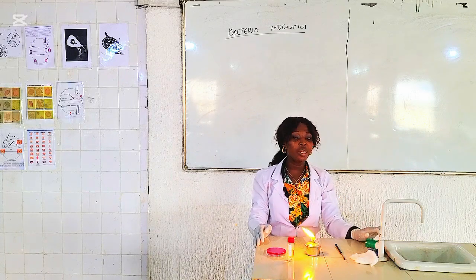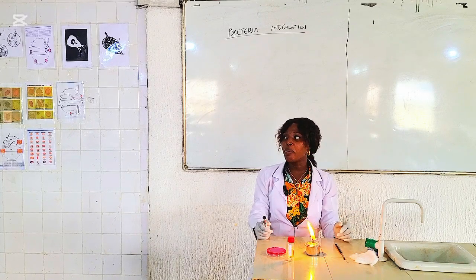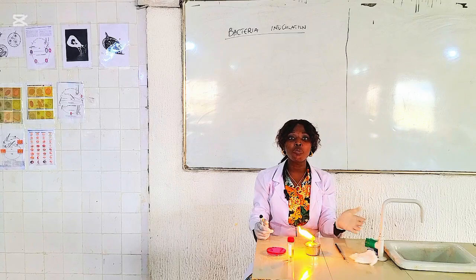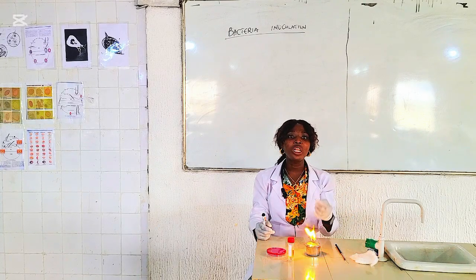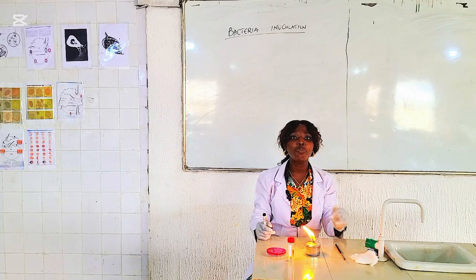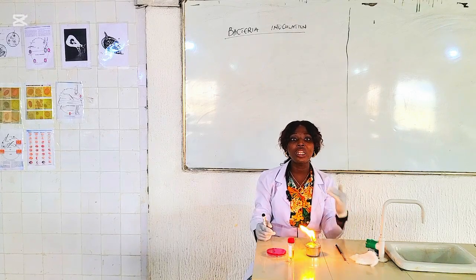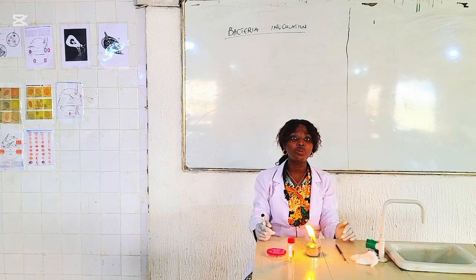So for today's learning purpose, we're talking about bacterial inoculation. Earlier on, we spoke about how to prepare culture media. Now, I want to talk further on how to actually culture on this prepared culture media, that is, how to inoculate the samples or organism into this culture media.